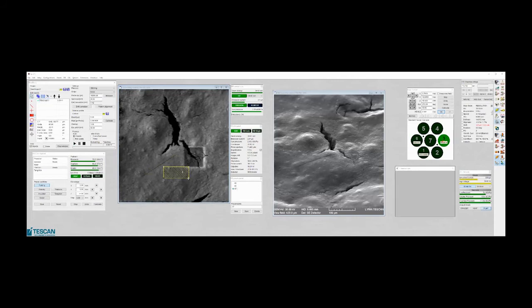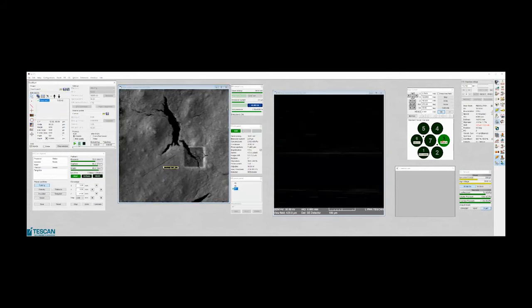So I will play with it. Okay, 2 minutes. I will let it run and I will stop it then. It's scanning only in the area where you place it, there and back. So it's milling your material away and creating the structure which you need.